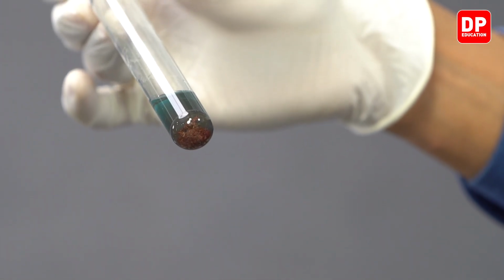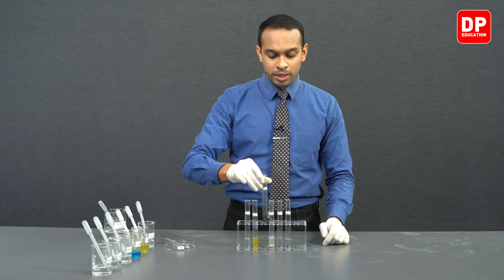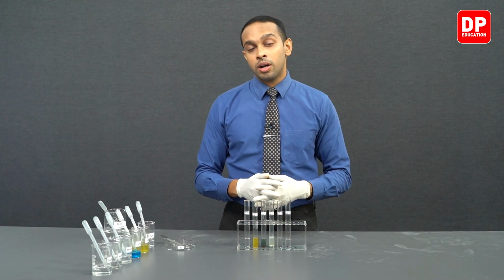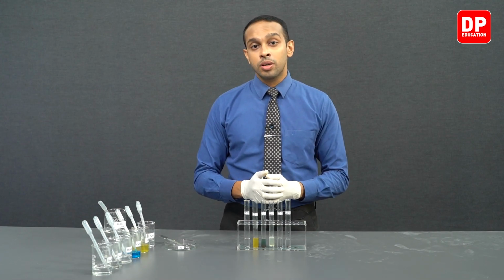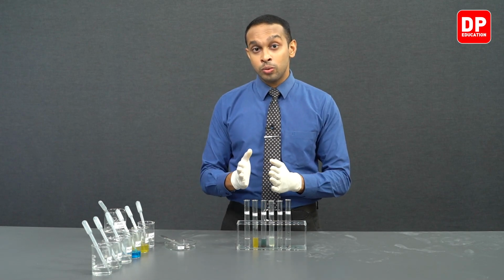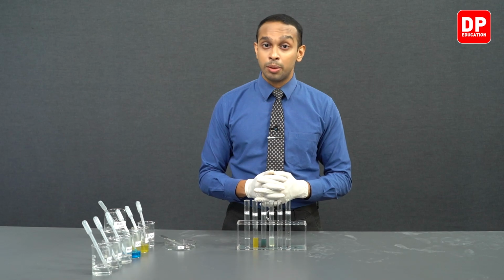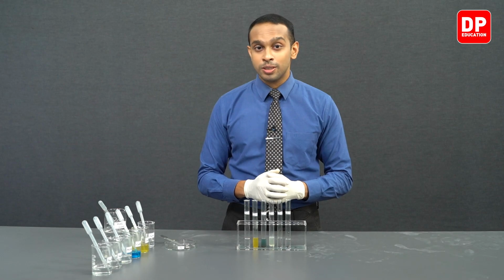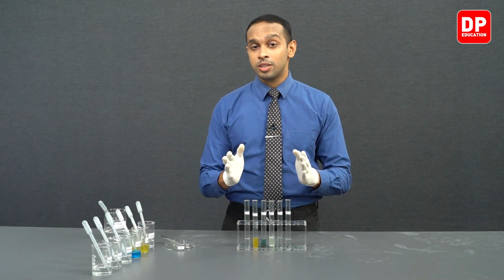This brown color precipitate is because the Cu2+, or in other words cupric ions present in the medium, got reduced to form copper solid. So the zinc metal that we added to the Cu2+ aqueous ion solution was capable of reducing Cu2+ or cupric ions to copper solid. So what does this mean? Zinc is more reactive than copper. In the reactivity series, zinc will be found somewhere above copper.